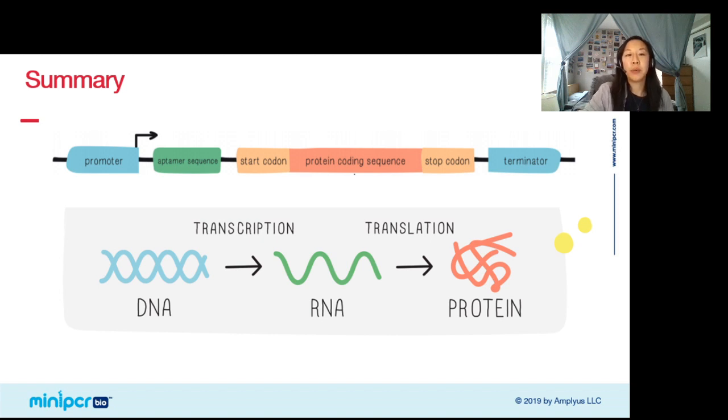I was able to do it live from my bedroom with just a pipette and a blue light illuminator. It's been really great because this activity was something I developed in my PhD, and I've gotten to see it grow from my PhD lab into actual classrooms. It's always great to see students' faces light up when they see the glowing green and the glowing red for the first time. And now I'm here doing the lab with dozens of people over the internet. It's really great to see this lab come a long way.